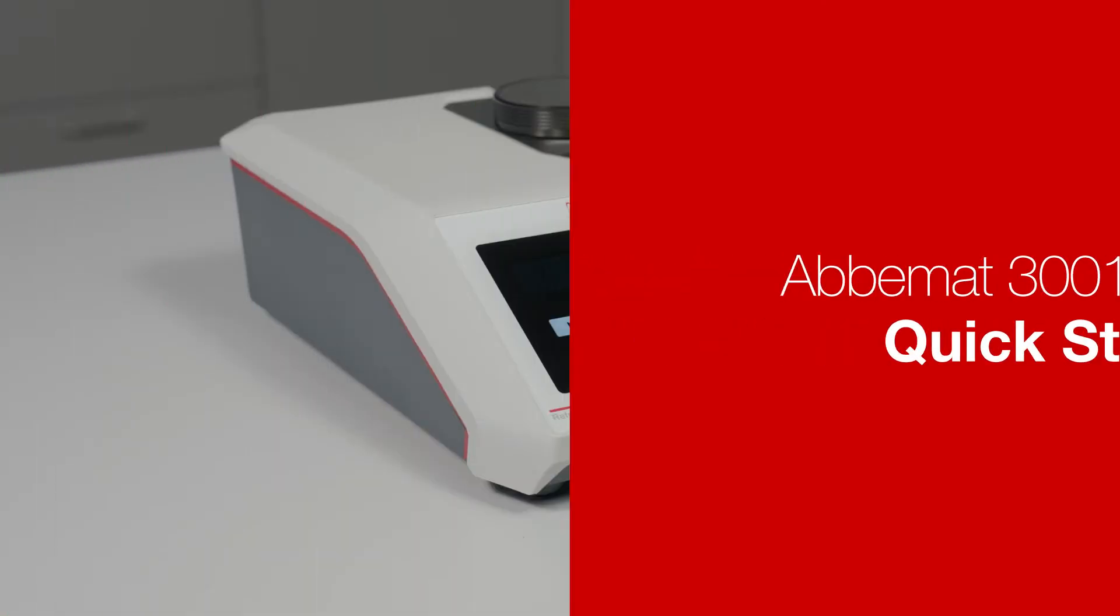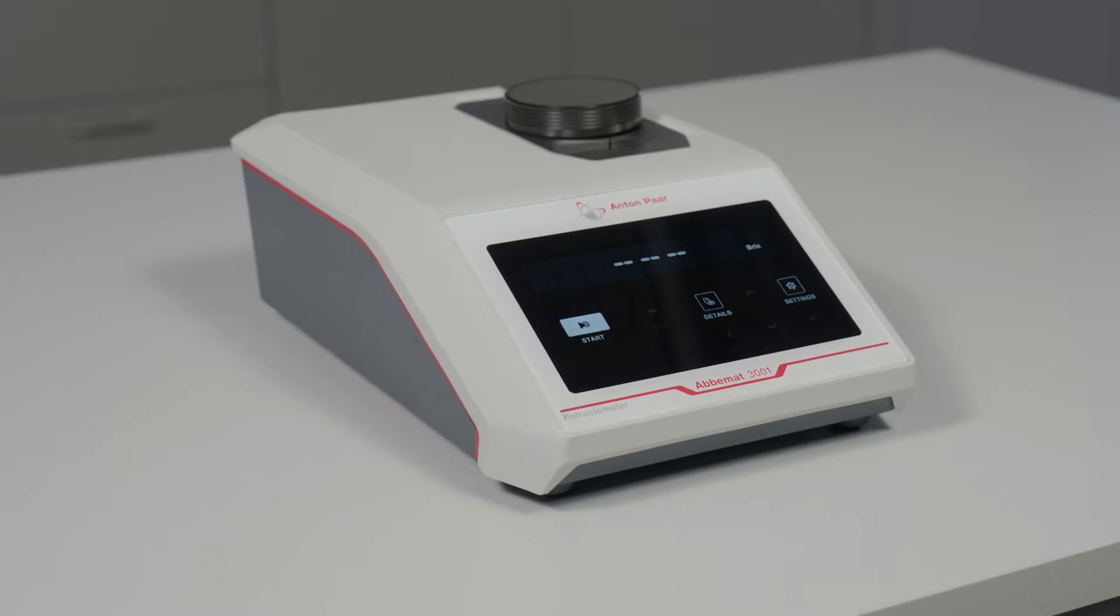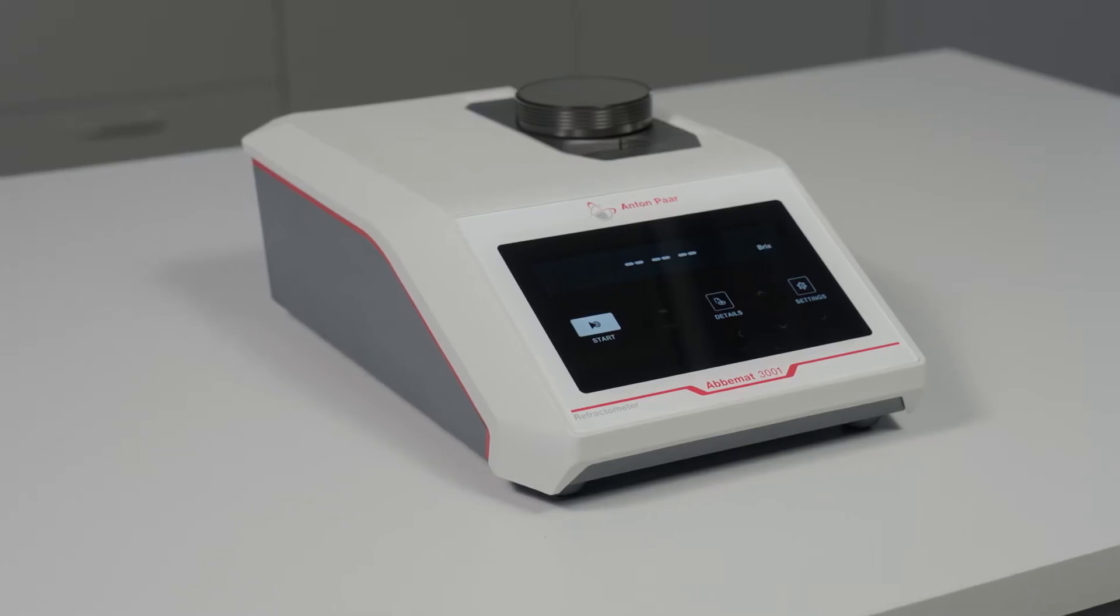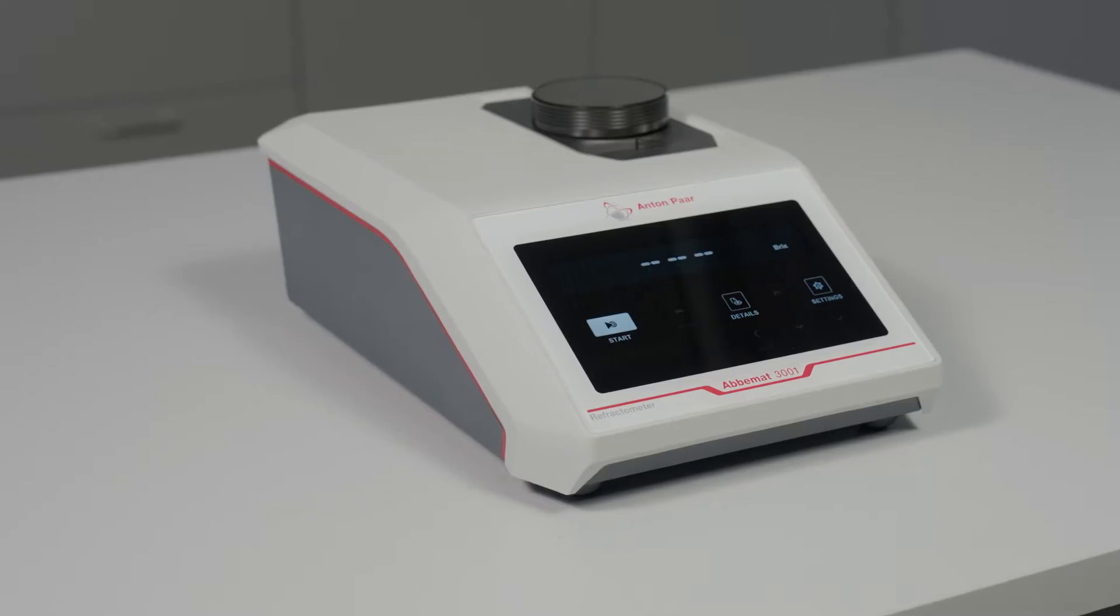In this video, we will show you how to start and operate the Abimat 3001, 3101, and 3201 refractometers.